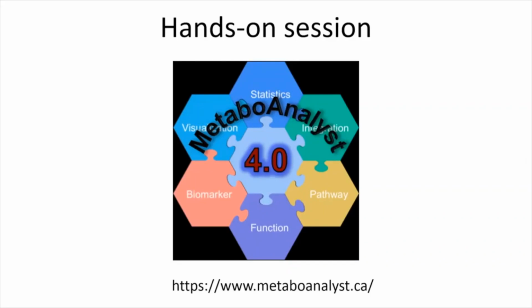For this particular statistical analysis, you can use any software that you want. For example, you can do all these steps of the statistical analysis in Python, you can do all this analysis in R, and there are other software also available which you can use. But I'm showing the hands-on session in Metaboanalyst. The reason is that this is a very compact software with almost all the statistical analysis parameters present, and also this particular software is a user-friendly online software.